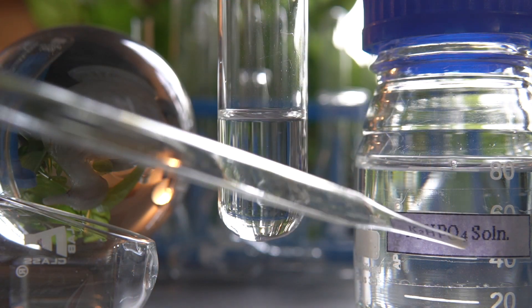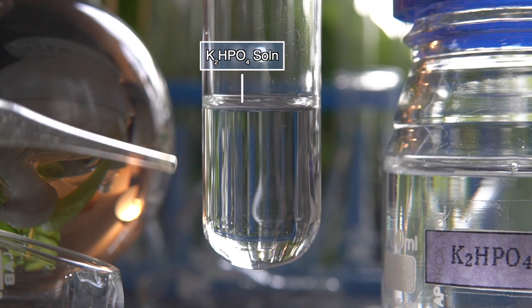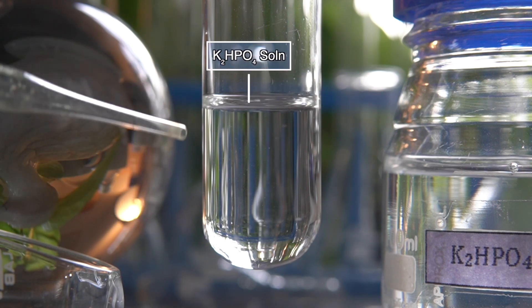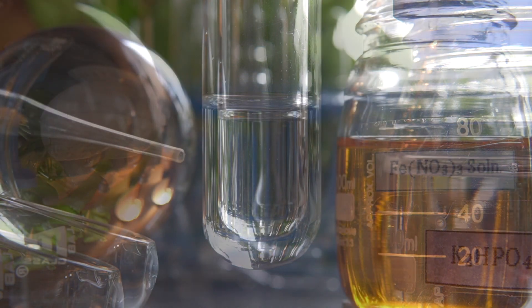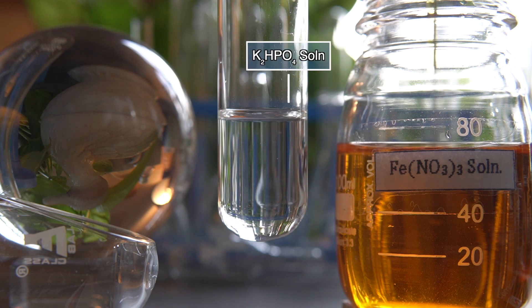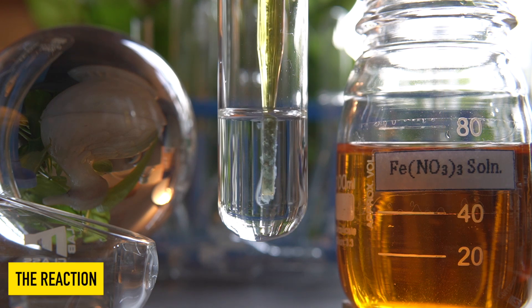To initiate the chemical reaction, we will take some potassium hydrogen phosphate into this test tube. Now we will add iron three nitrate into the clear potassium hydrogen phosphate solution and observe the effects.